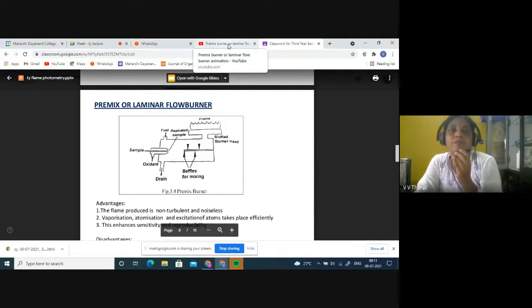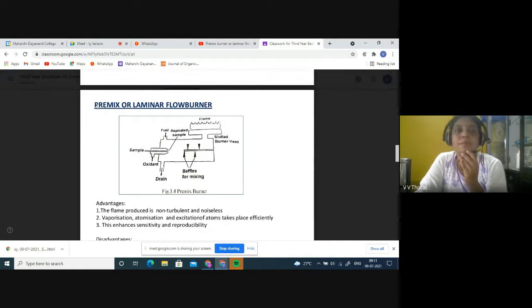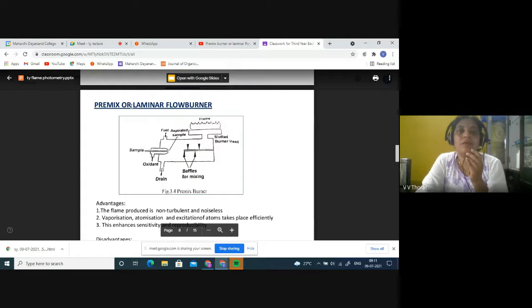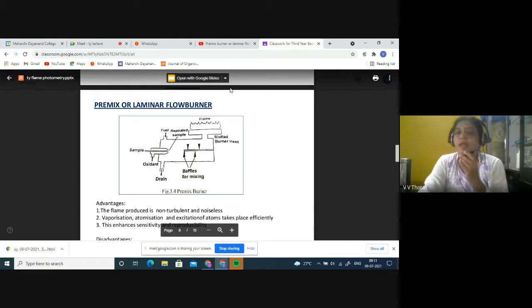I will show you pre-mix. What is the name of the burner? Everyone listen. It is a pre-mix because we are mixing sample, oxygen and fuel first. Or it is also called a laminar flow burner. Am I audible to all? Yes, ma'am. Now everyone be alert.